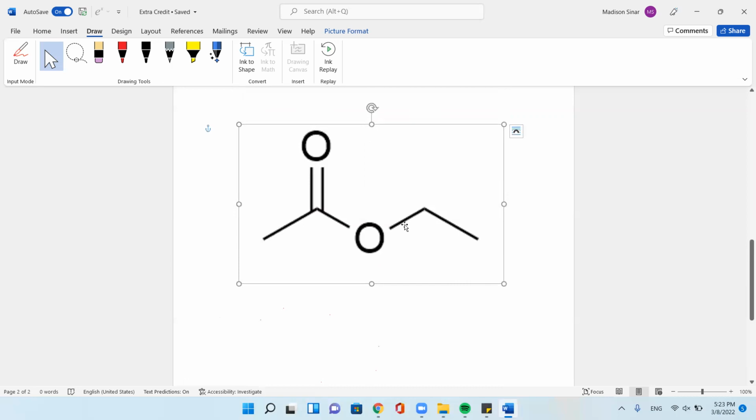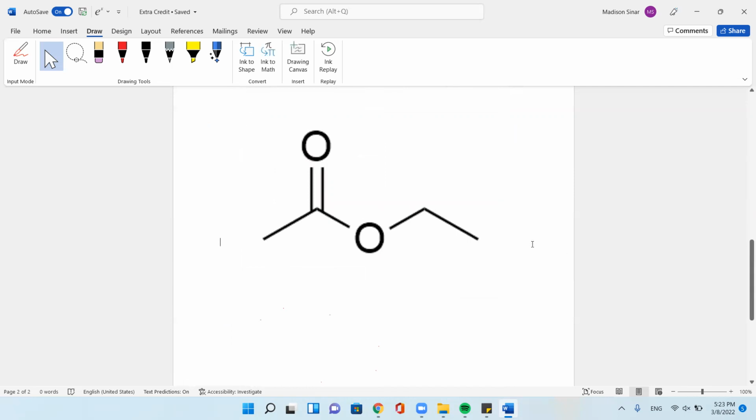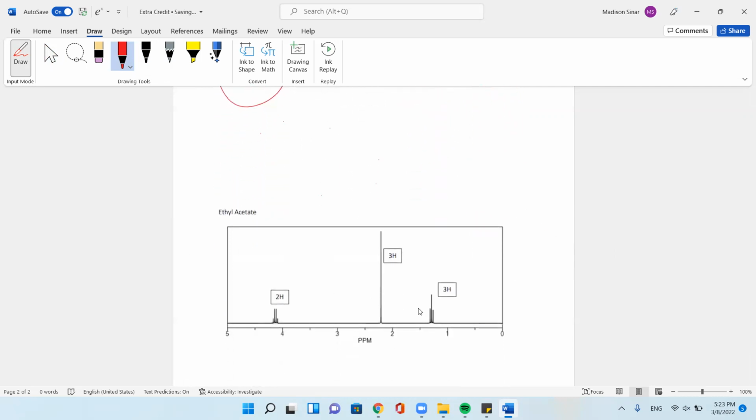So to start with, I used this NMR as an example when explaining that, but we'll start with ethyl acetate. If we're looking here, we see it has a ketone and an ether. It'll also have, as we can see, 1, 2, 3 hydrogens, 4, 5, 6, 7, 8. We know that this is only going to be one signal because all 3 of those hydrogens are identical. Again, these hydrogens will be identical, and then so will these. So we know without even looking at the NMR that there will be 3 signals. And if we scroll down, we see this is the case.